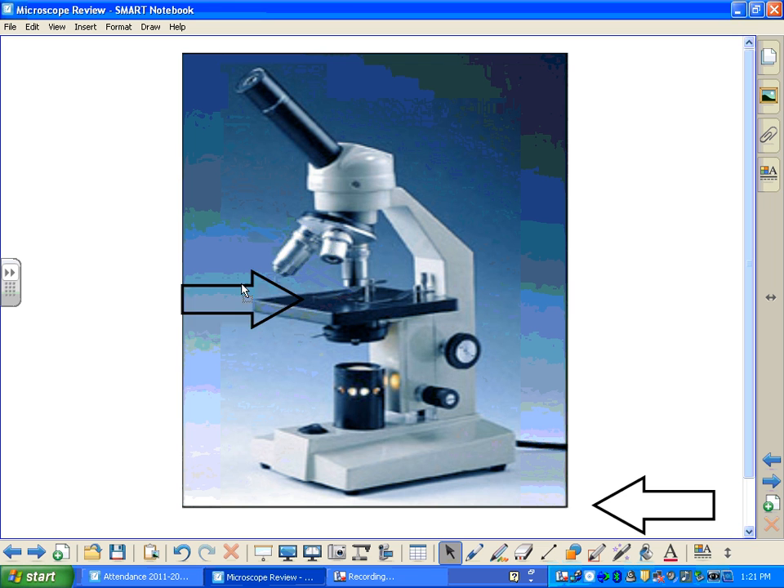Below your lens is the stage, where you'll clamp down your slide and your specimen using the stage clips. Below the stage is your light source, which is controlled by an on and off button.